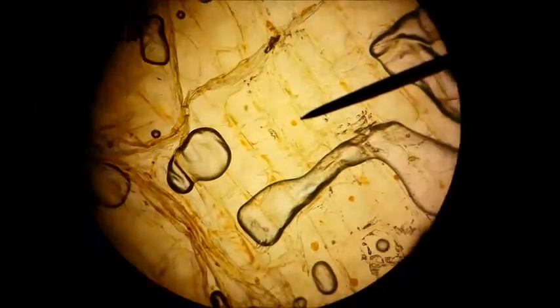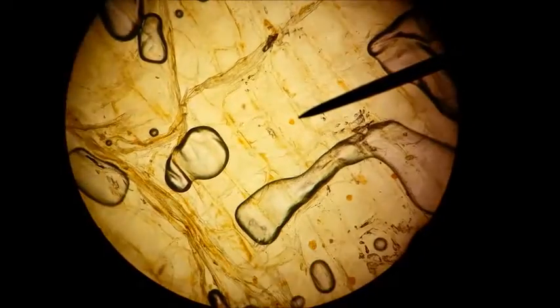You can see the cellulose cell walls on these. Hard to see nuclei even though you can see it on the other stain. This is crystal violet. All right, this is an iodine stain and it comes out pretty good.